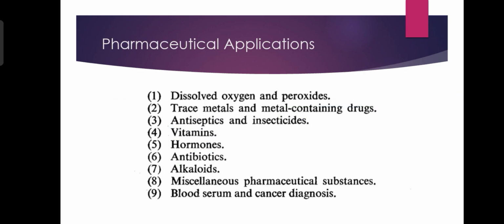Next, pharmaceutical application. Basically we use it for detection of metals or organic compounds. In this process, the pharmaceutical application uses the polarography technique for dissolved oxygen and peroxide, trace metals and metal-containing drugs, antiseptics and insecticides, vitamins, hormones, antibiotics, alkaloids, pharmaceutical substances, blood serum, and cancer diagnosis also.